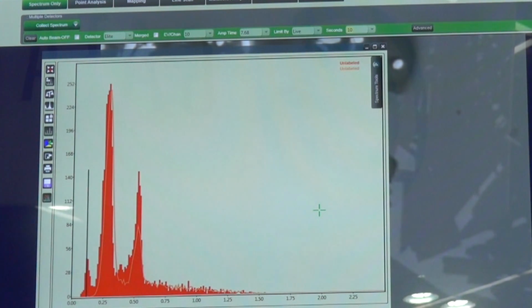So silicon L line for pure silicon will be at one position. Silicon L line for silicon dioxide will be slightly shifted. So it's not exactly clear anymore what's the position of the lines. Another thing to take into account, we are now generating X-rays very, very close to the surface.